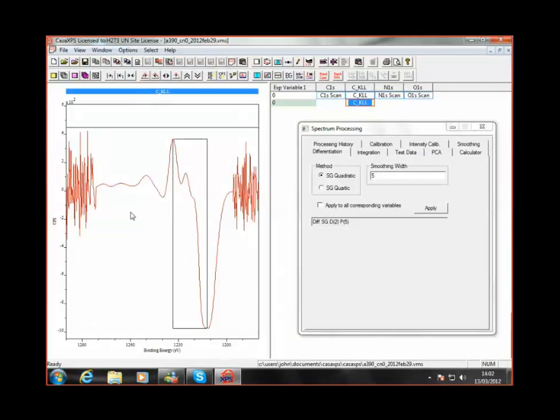Great. So did I see a 21 point something eV difference between them? I think yes, which is reasonable. I think Lascovich called this the D parameter, and something in the early 20 electron volts corresponds to graphite, which this happens indeed to be a sample of graphite, and smaller values of D correspond to higher degrees of sp3 hybridization.